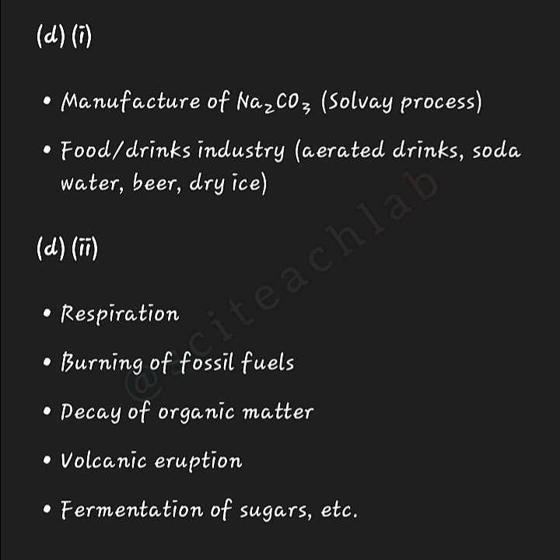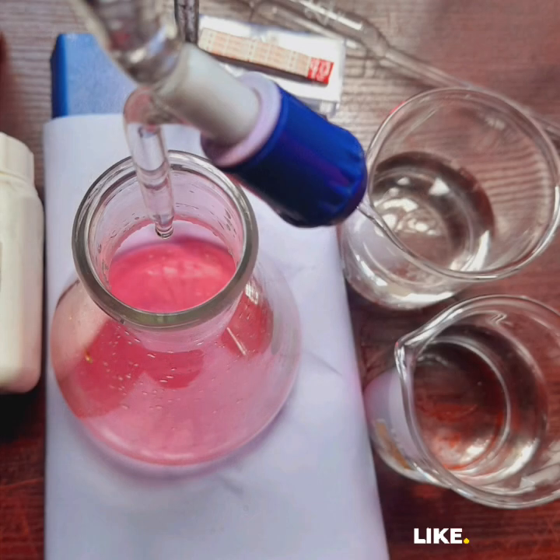But follow the instructions carefully. Make your calculations carefully. Avoid errors due to parallax reading. When you set up your burette and pour in the acid, the meniscus may not even sit on the 0 line, and then you start titration but you record 0. That's an error. It wasn't 0. Or maybe it's even above it, or it's hanging on it.